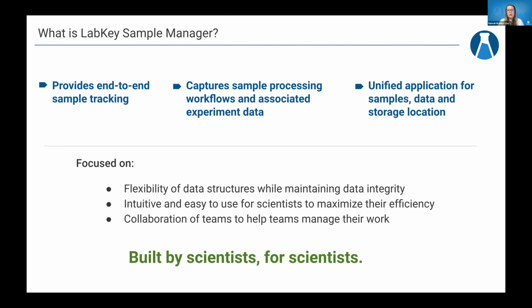And when we started creating Sample Manager about 3 years ago, we knew we wanted to allow the application to be flexible for creating data structures that map the exact needs of the terminology and the science that's happening in your lab, while still maintaining that data integrity component that LabKey is known for and most of us all know and love.